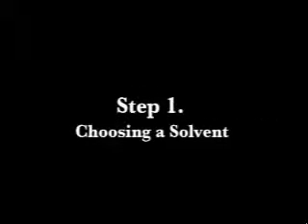Choosing an appropriate solvent for a recrystallization is a very important step. You won't get acceptable results if you don't pick carefully. It is helpful to have a variety of solvents at your disposal. If solubility data for your compounds has been published, this will help you to narrow the range of potential candidates. Once you have decided on a few prime contenders, you will perform solubility tests to find the ideal choice.